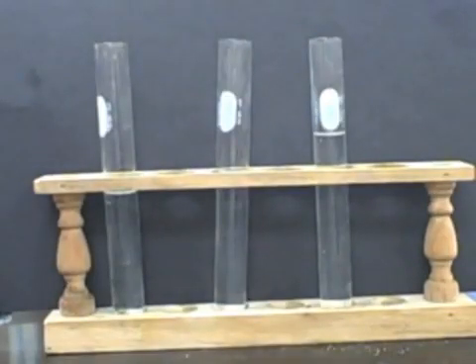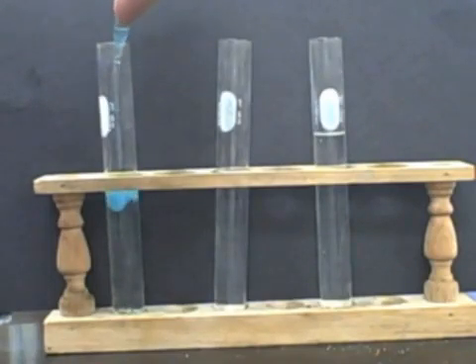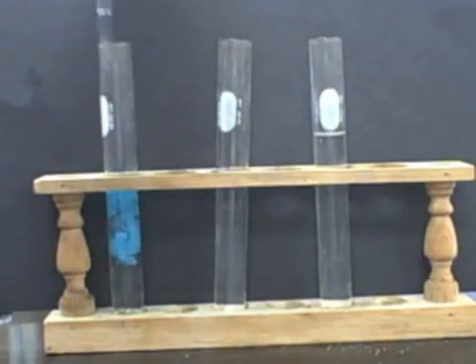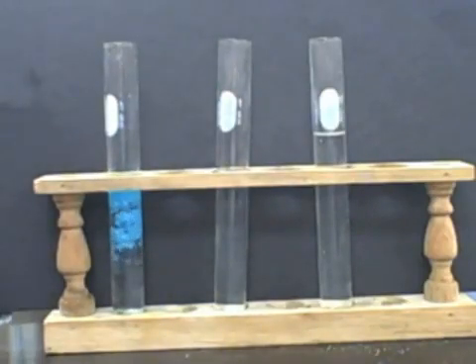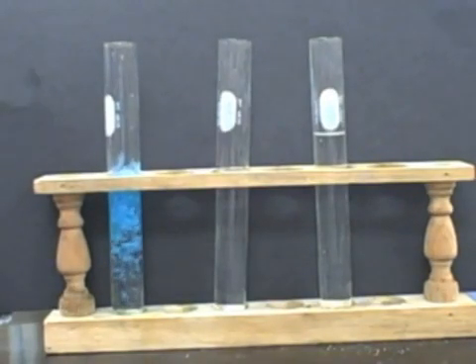Alright, so now we're doing transition metal carbonates. So we've got copper sulfate and sodium carbonate. You can see, actually that's almost the same color as the copper hydroxide. A little darker in color. The surface just bulged a little bit. Yeah, a little bit darker in color.